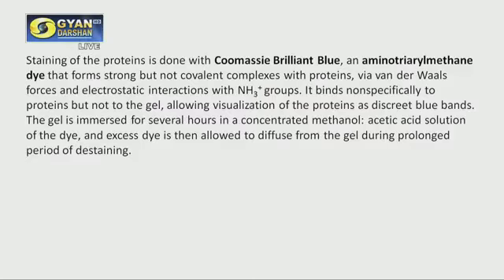And even if you have overstained the gel, there is a system by which you can counter stain it. You can de-stain it to remove the excess stain. But for proteins, normally we use this CBB, we call it in short, that is Coomassie Brilliant Blue.